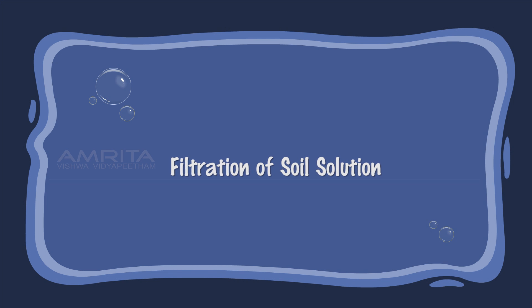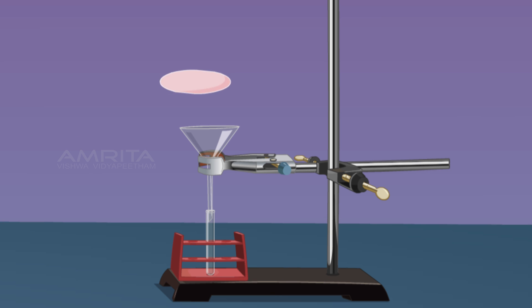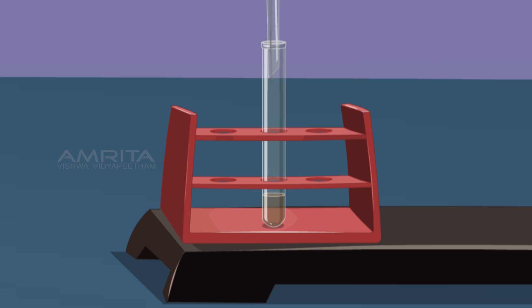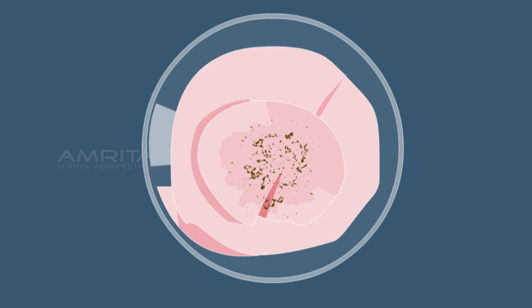Filtration of Soil Suspension: Place a funnel over a test tube using a clamp stand, then place a filter paper in the funnel. Now pour the soil suspension through the funnel. A clear filtrate is obtained and soil particles are seen on the filter paper. This indicates that suspended components of a suspension can be separated by filtration.